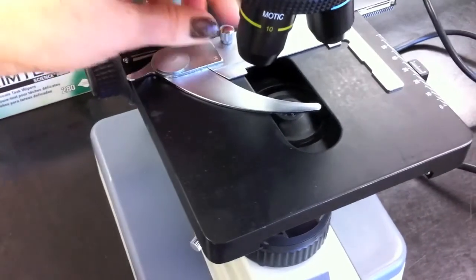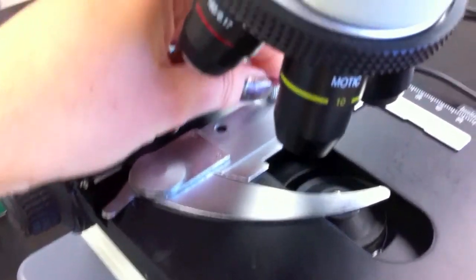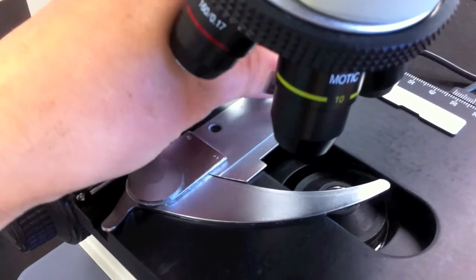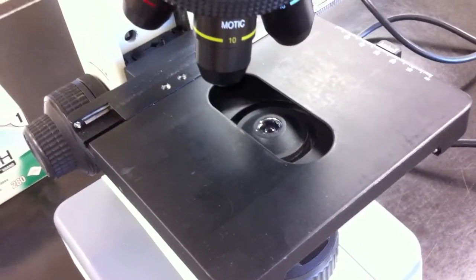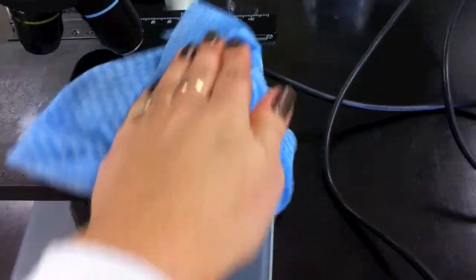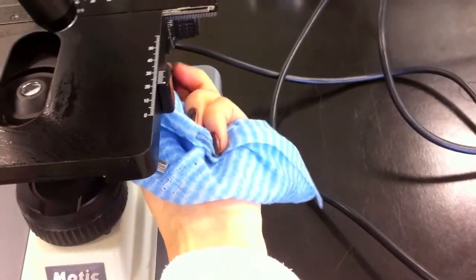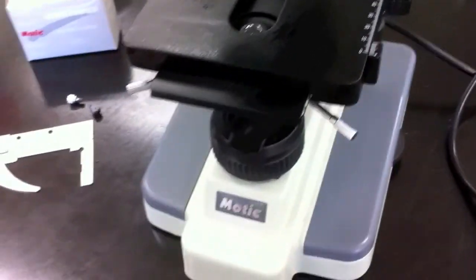We're going to take off the stage clips — this microscope has screws so we'll take the screws off. Then we're going to use the cloth and wipe the stage, moving it back and forth just to get the back area. Let's look at the front.